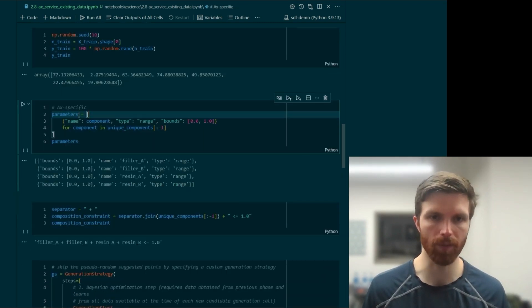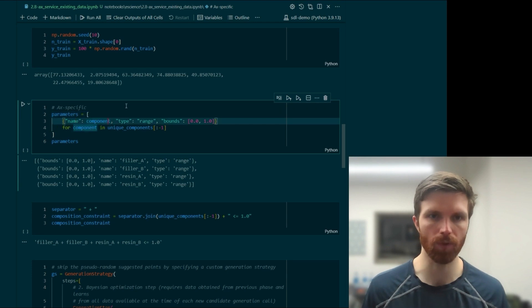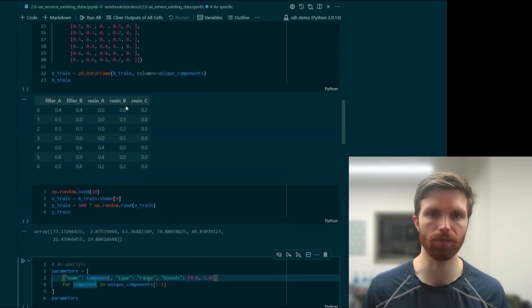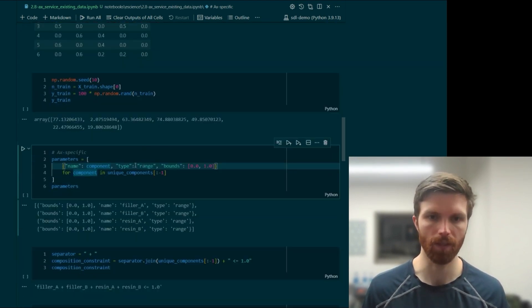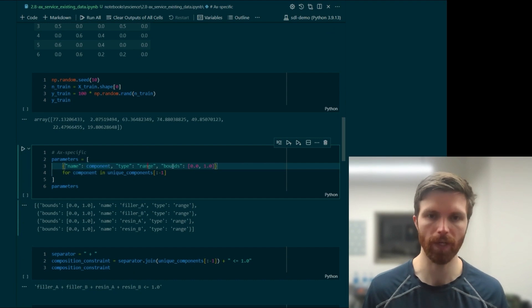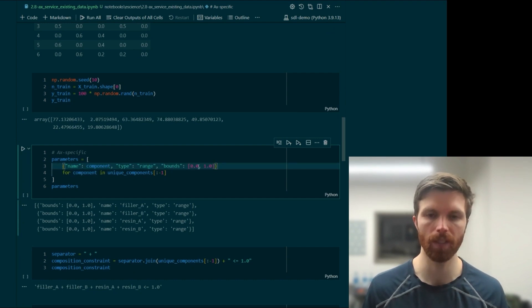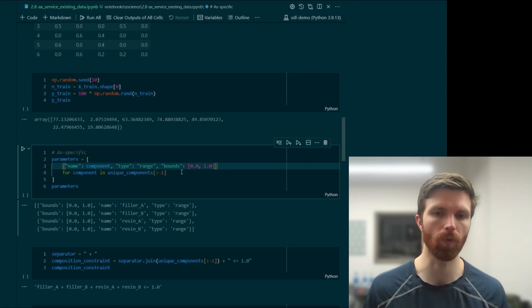We'll create our parameters. We have the name corresponding to each of our components here. And we have as a range parameter, and we'll say that the bounds can be between 0 and 1.